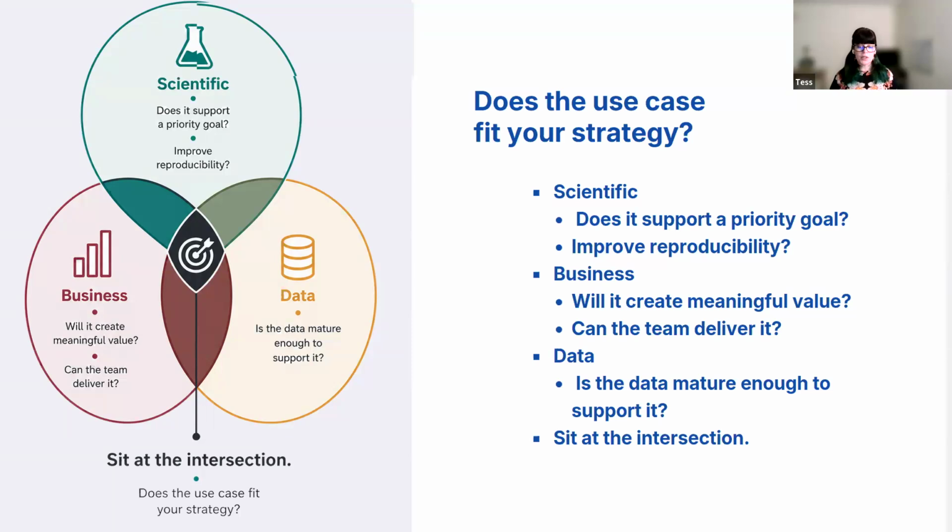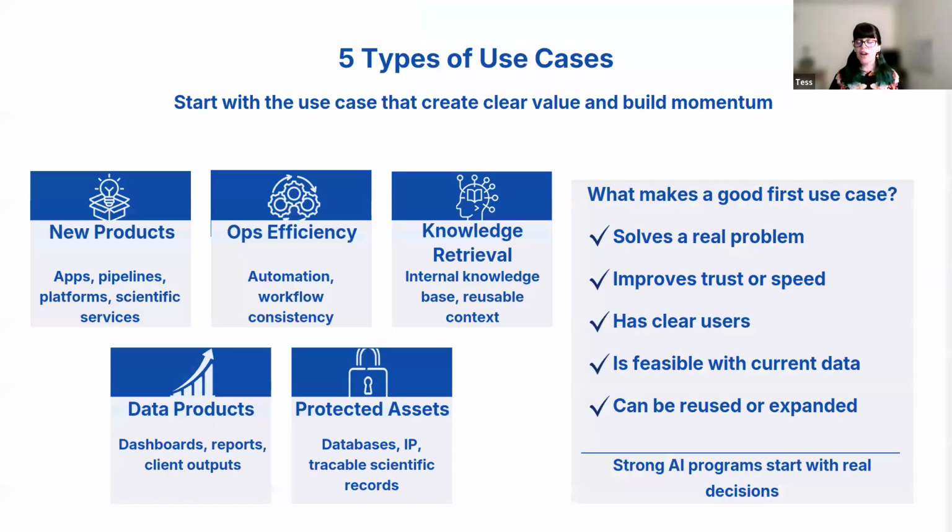So what are different use cases that you can create? There are 5 different types of use cases that you can create. And it's important when you're in this process of choosing use cases to try to come up with different use cases in each of these. You start with a brainstorming session. You want to make sure that the use case that you have solves a real problem and has clear users.